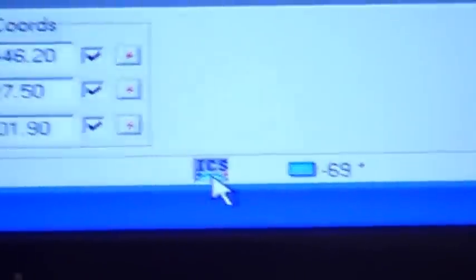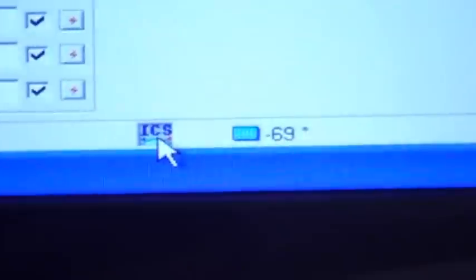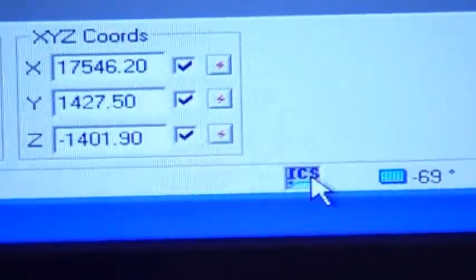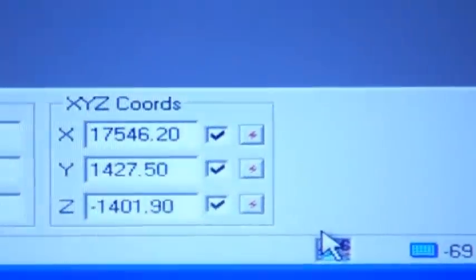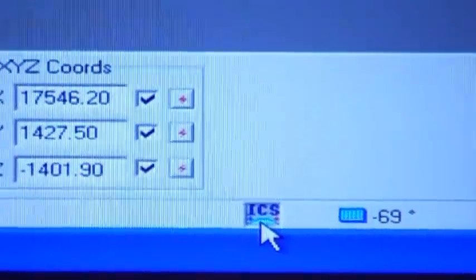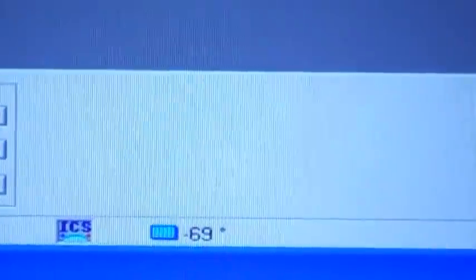The system is equipped with 2 edge filters. The materials in the edge filters actually make a little ripple in the data. So the instrument has been trained to know what these look like and will actually remove them out of your data for you automatically. If ever you see that the ICS icon is not there at the bottom, it means someone has turned this feature off, and your data will most likely have lots of little bumps and ripples in it, which you can always save your data and manually subtract the ICS data from it.